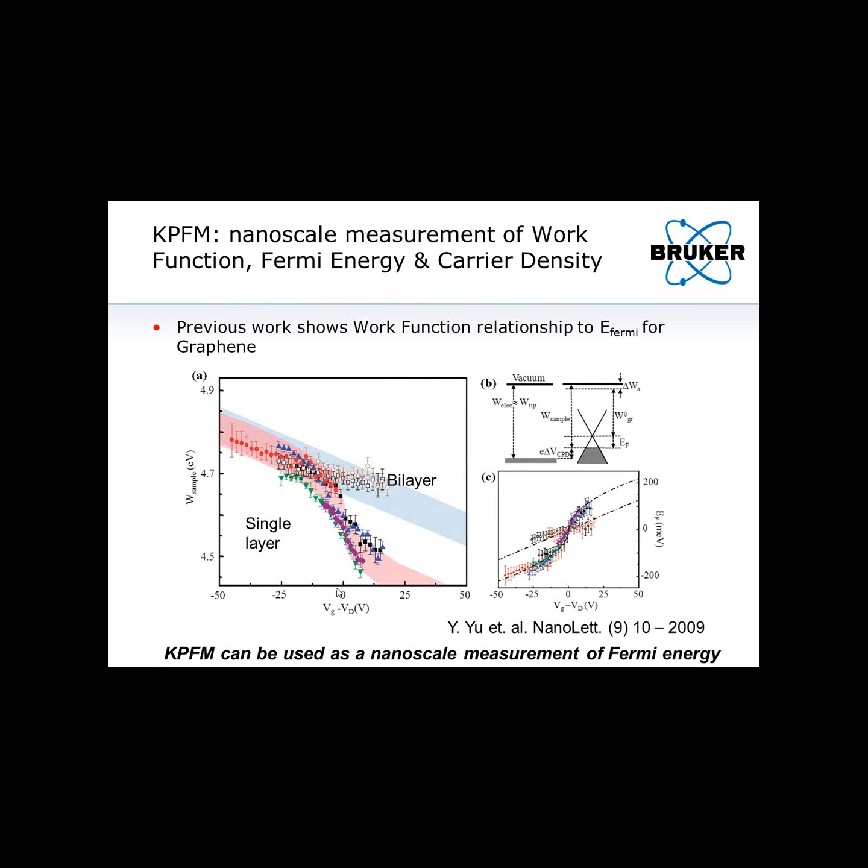And this is one of the first papers I found on this technique. What's interesting about this paper is they also performed these measurements in a nitrogen environment. And the two traces that were in that environment are the blue and black traces here.